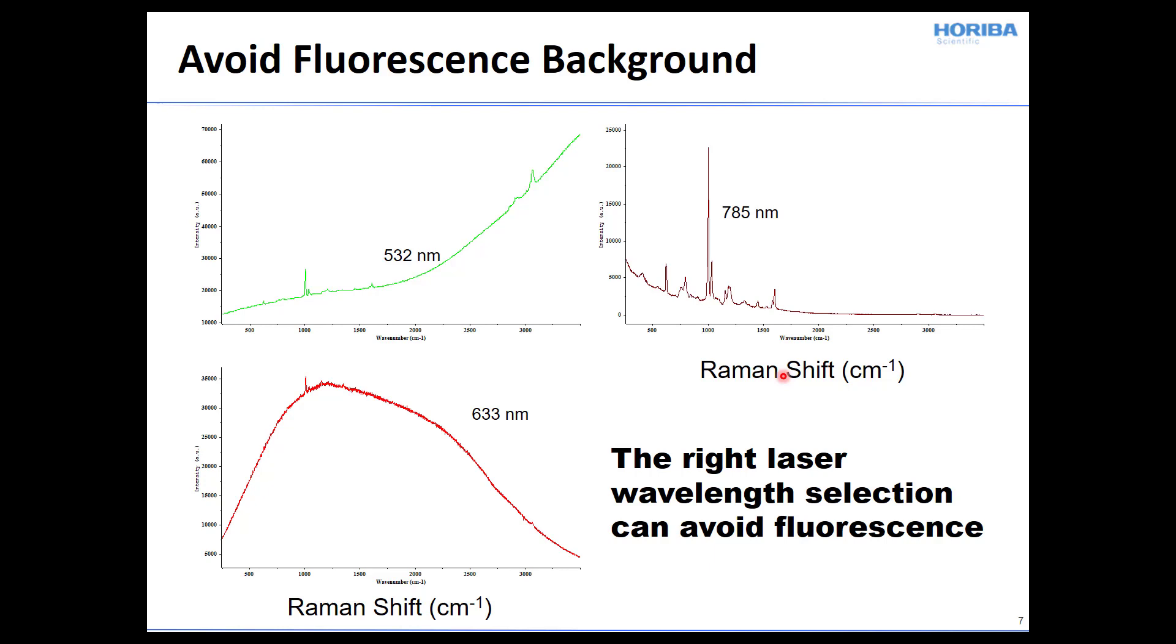So if we plot these same spectra separately now, I think you can see clearly, if we excite at 532, we're just on the onset of the fluorescence, you can still see the Raman bands there. And you could certainly, using the software, do a background subtraction. However, once you get to 633 nanometer excitation, even a background subtraction won't help because the bands themselves are lost in the noise. Whereas at 785 nanometer excitation, we're removed from the fluorescence altogether, and so we get a very good signal to noise in our Raman spectrum.